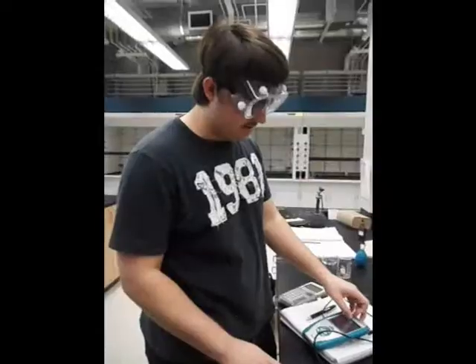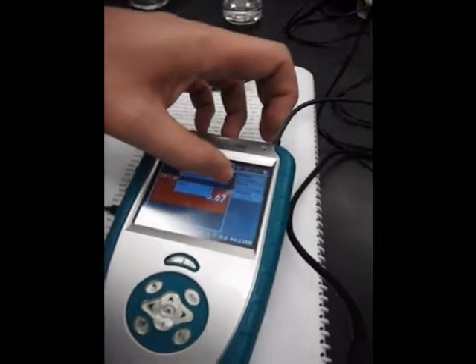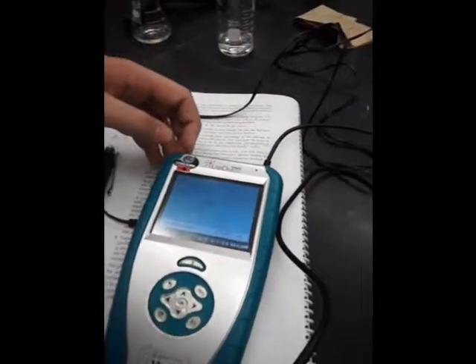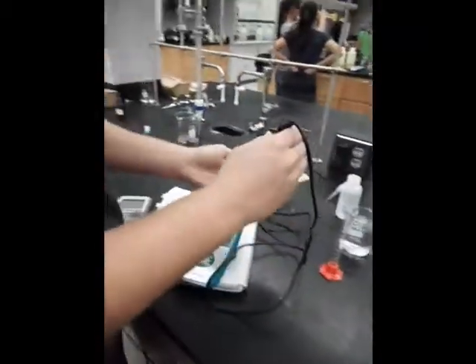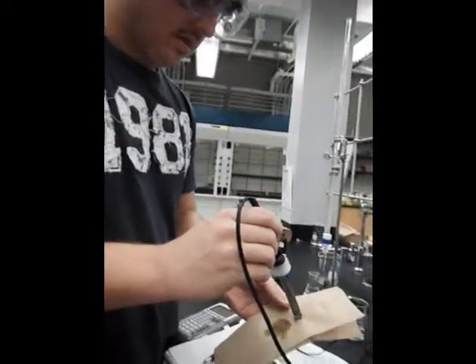Today we are going to do pH calibration. First you need to remove the pH meter from the distilled water. Whenever you're drying it, dab it lightly so you don't hurt the electrode.